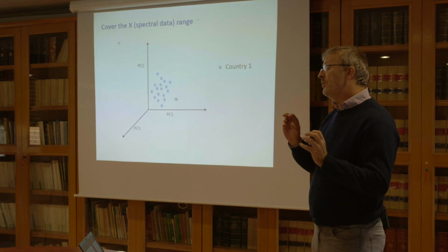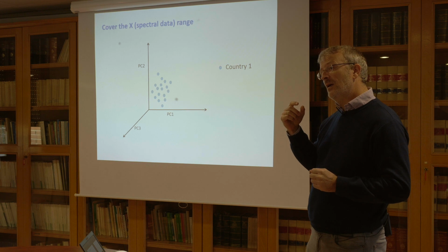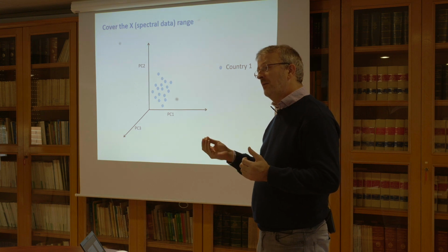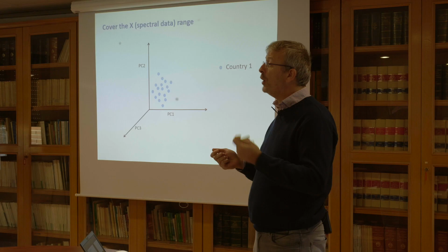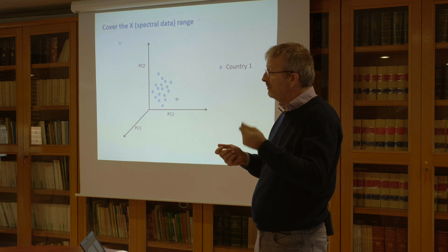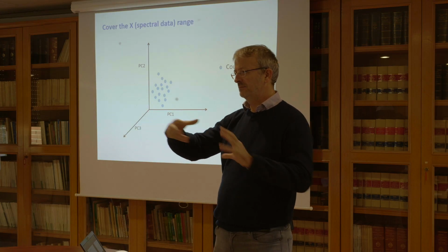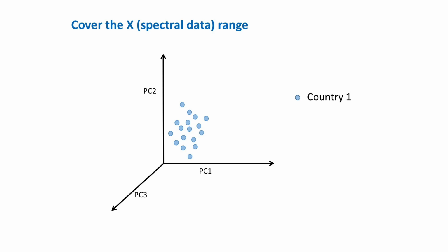It gives us the idea of the robustness related to the reference analysis, but keep in mind that sometimes, for example, a spectrum of a milk gives you 4% of fat, but another one, another spectrum, very different, gives exactly the same reference analysis, 4% of fat. It means that we need also to cover the whole variability in the spectra, because there are some relationships in the spectra that can be different, and give you exactly the same reference analysis, and you need to cover this variability.